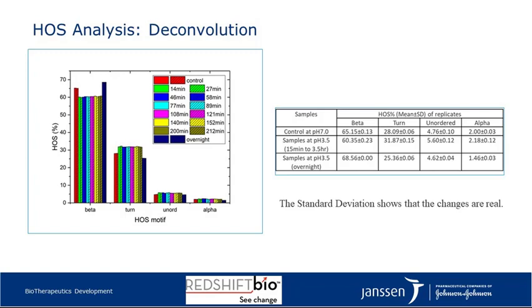And this is further giving us insight that we believe what we're seeing here is actually not something to do with a long-term hold, but is actually a conformation or a possible colloidal interaction taking place in solution.